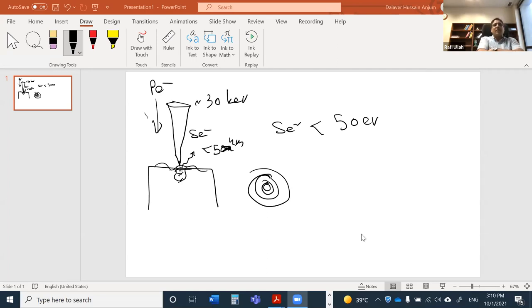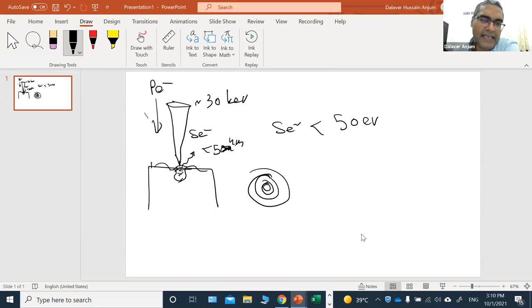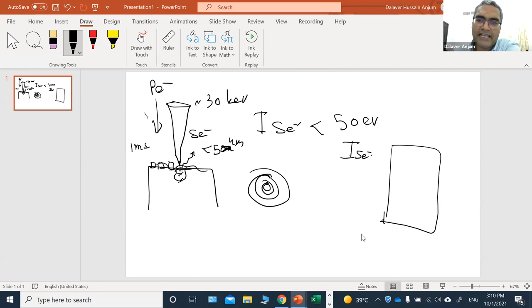Yes. Okay, so this is the secondary electron. At each pixel of the raster scan, we stop, let's say, for 1 millisecond, and we get the intensity of this signal, S, an electron signal. Let's say my raster scan was of that shape. We literally just make a matrix: here I got 100 electrons, there I got 50, and here I got 1,000, and so on.